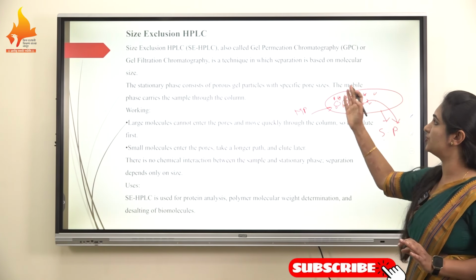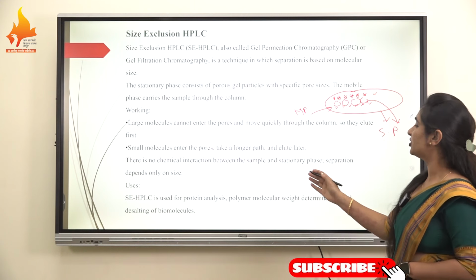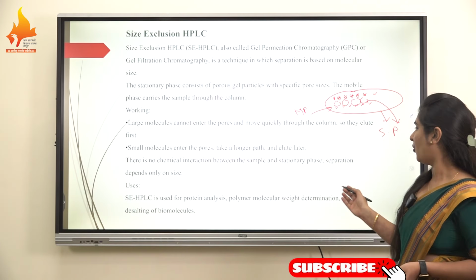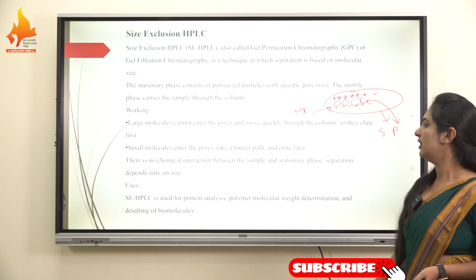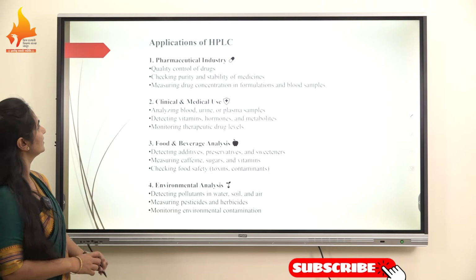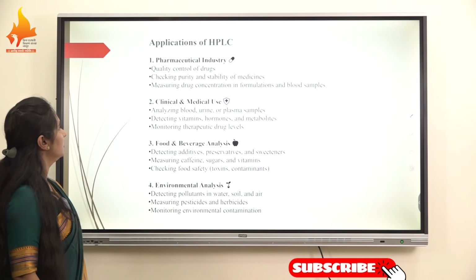Size exclusion HPLC is used for protein analysis, polymer molecular weight determination, and desalting of biomolecules. These are the applications of HPLC.